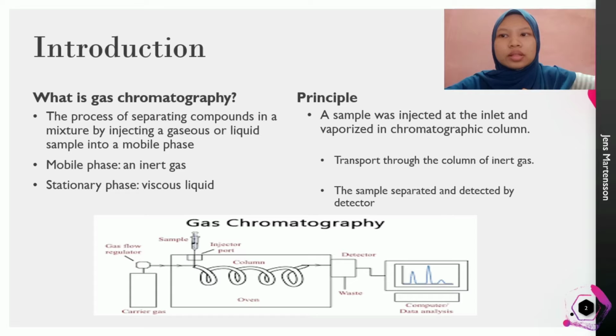The glass or metal column through which the gas passes is located in an oven where the temperature of the gas can be controlled, and the effluent coming off the column is monitored by a computerized detector.